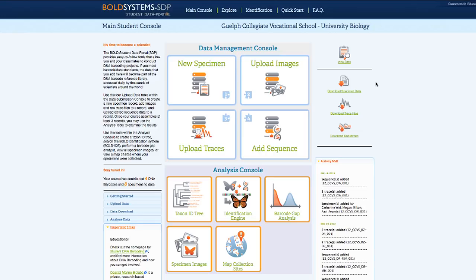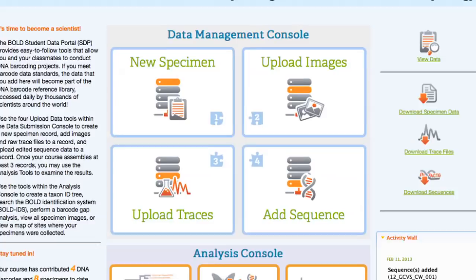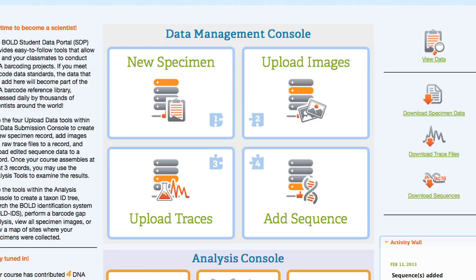There are also options for viewing and downloading data. Data submissions were designed to allow different elements to be uploaded separately, allowing multiple students to contribute to the creation of one record. These elements need to be submitted in order, starting with specimen data, then specimen images, trace files, and finally sequences.